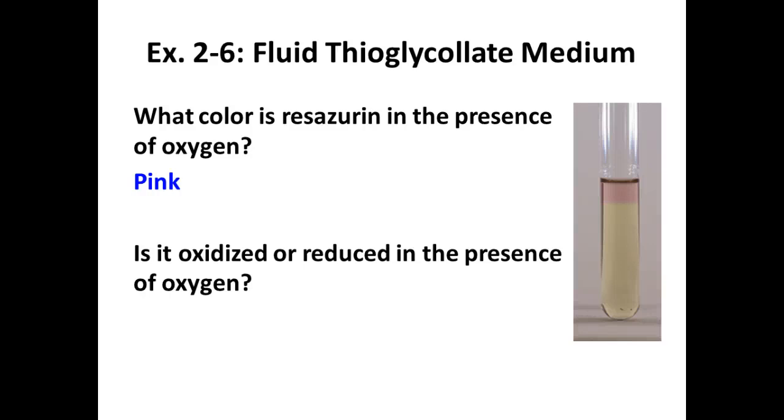So is it oxidized or reduced in the presence of oxygen? There's an old saying that I always remember, right? OIL RIG. Oxidation is the loss of electrons. Reduction is the gain of electrons. So in this case, this reagent becomes oxidized, right? It actually loses electrons in the presence of oxygen. All right, and it's going to give us this pink color.